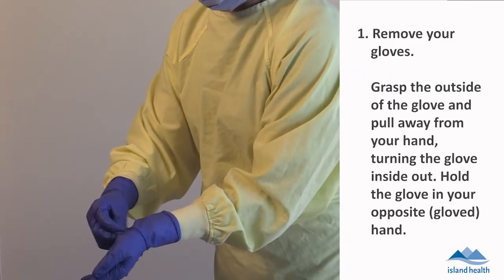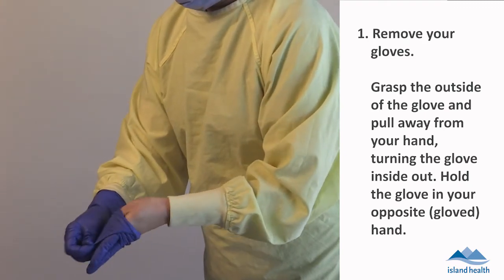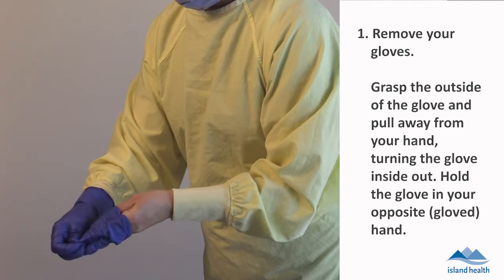Remove your gloves. Grasp the outside of the glove and pull away from your hand, turning the glove inside out. Hold the glove in your opposite or gloved hand.